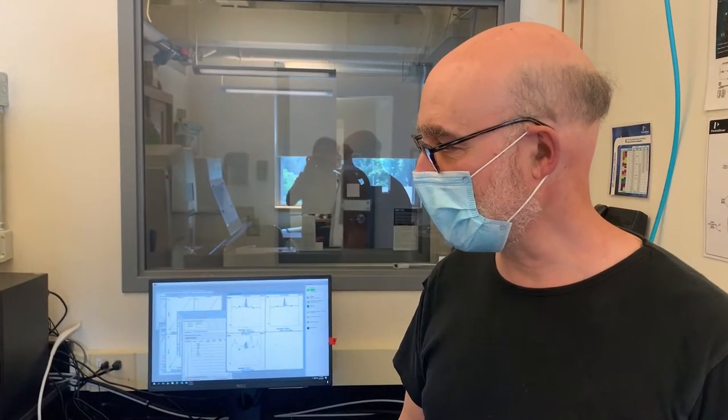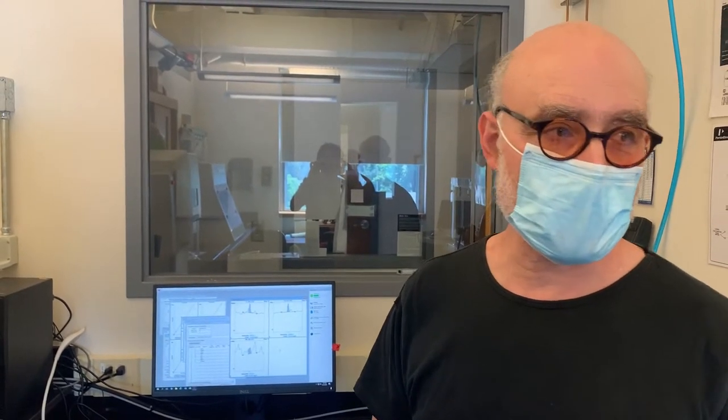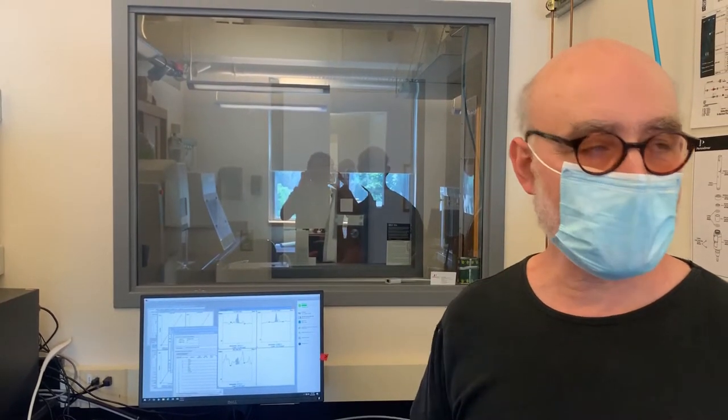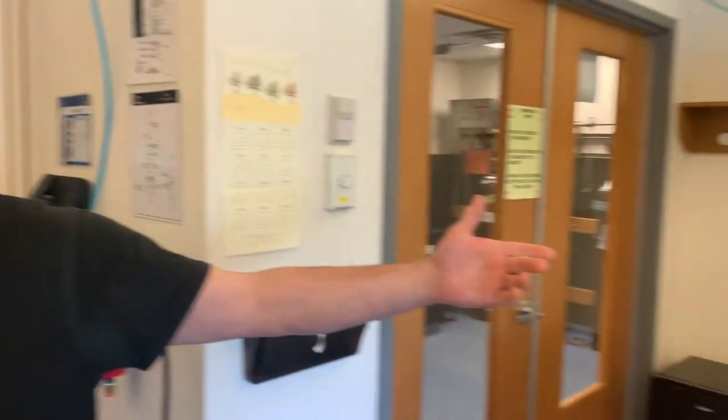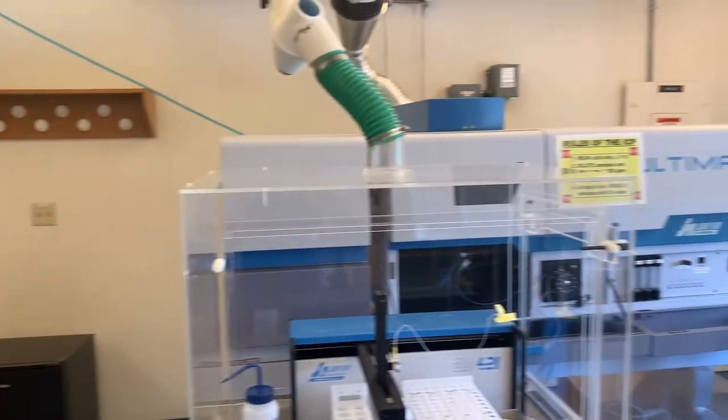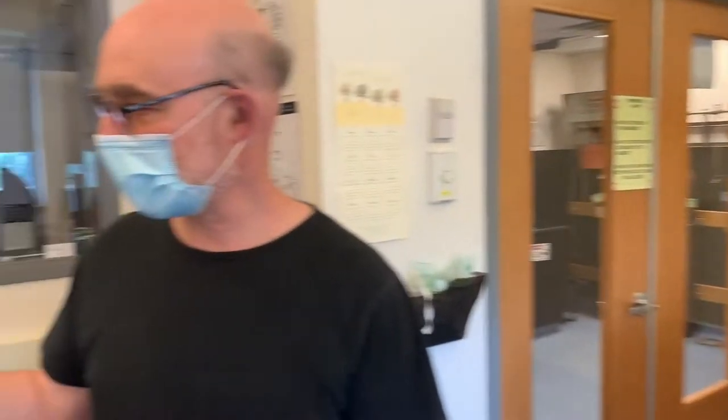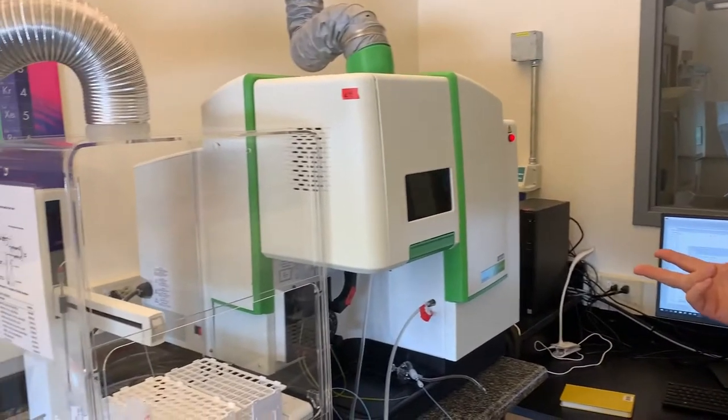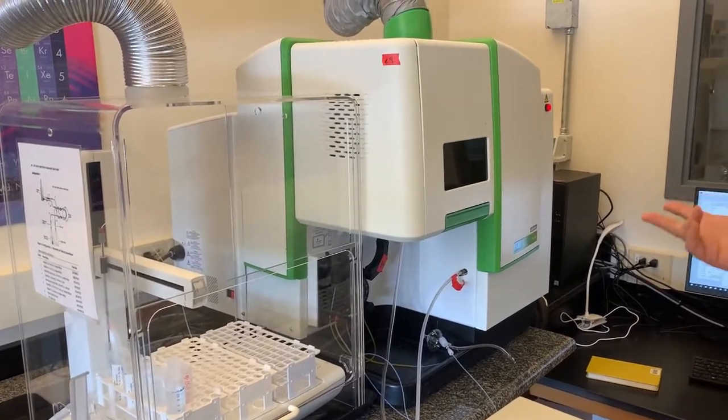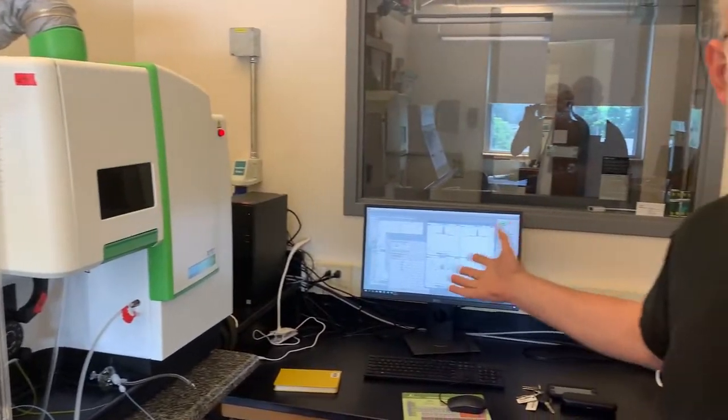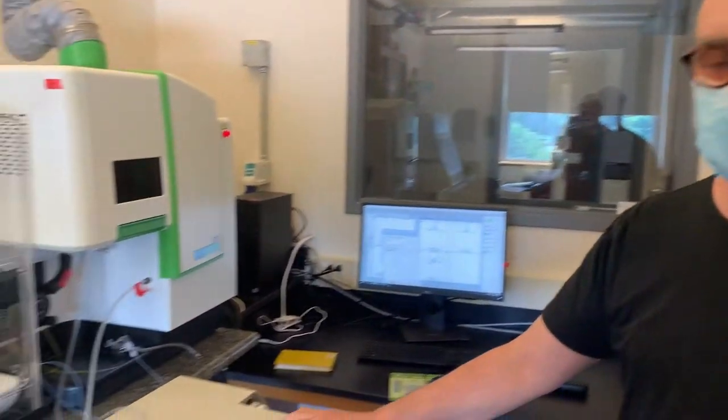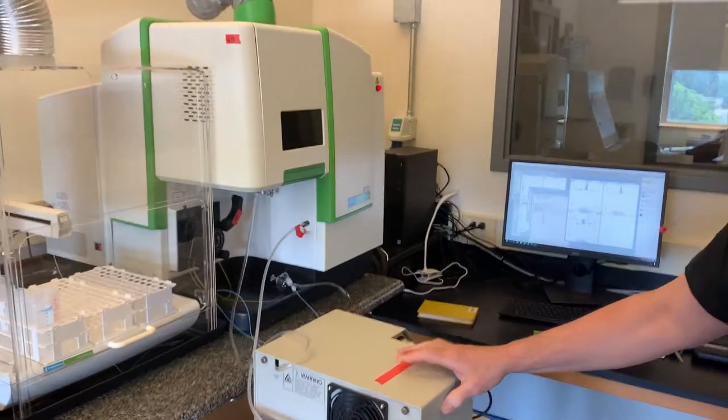All right, so I'm here with Nico in the ICP lab in the geology building in Delahunty. We have two ICPs here. There's an older one that's an Ultima from the company JY. It's a French machine. And then we have a Perkin Elmer that we acquired last year. This is a modern ICP that JY is 20 years old. This is today's ICP. Modern software, antique software running on Windows XP.